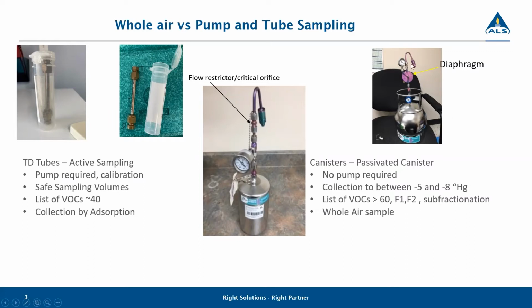The difference in setup: in this particular flow controller, we pull the whole thing apart. In this particular flow controller, again, we do take it apart, but the controlling object here is this cylindrical portion, which is a diaphragm. And when we calibrate these, we calibrate them using a digital calibrator, and there's a diaphragm in here so that there's a screw here that we can actually tighten or loosen, and the diaphragm inside is then adjusted to actually set the actual sampling time.